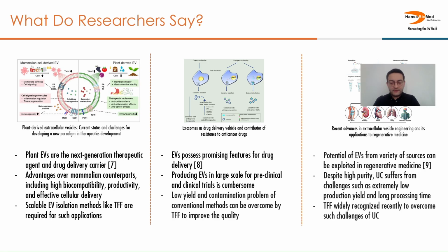And this paper as well points to tangential flow filtration as a widely recognized method to overcome the present challenges in EV isolation. So as you can see, overall, the main advantage or main positioning of TFF is to enable transitioning from basic research to the application stage, whether clinical or industrial.